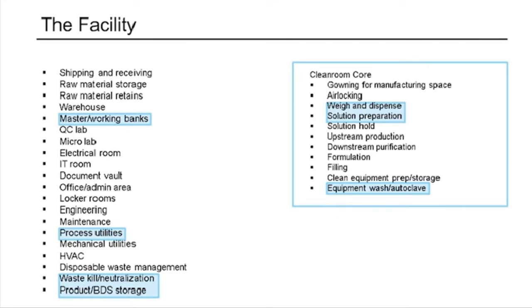In terms of product storage, if your cells are cryogenically frozen or if they are fresh going out, do you need refrigerated storage? Is it going to be shipped just in time? Do you need, for example, for an allogeneic larger scale production, banks of cryogenic storage freezers to accommodate your annual productions or things like that?